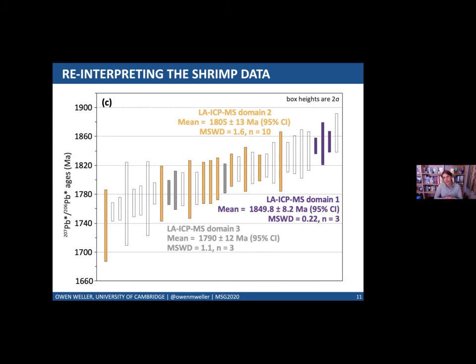And this certainly is why split stream laser ablation dating is probably the way forward, because obviously we've gone around the analytical mill twice here to get all of this data, whereas you would have got it all in one go with a split stream technique. Nevertheless, it would be very difficult not to have got mixed domains if you used a larger laser ablation spot, as we had spots here that were only 4 microns.